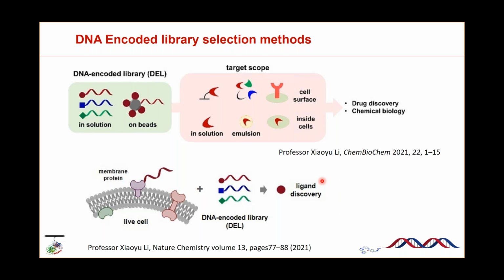And if you have direct reactions, you can use these types of building blocks, and they are working quite well. Basically, different types of amino acids can all be used in this lab for the scaffold synthesis or to make more diversity. That would be very great. So, yeah, I really love that you could use more building blocks as much as possible. That would be better.